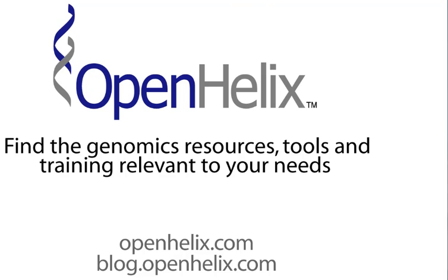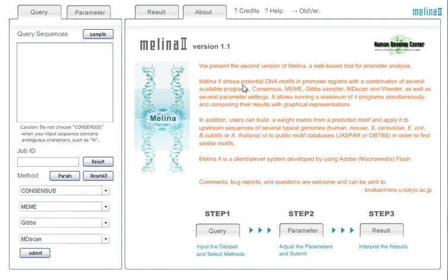But let's move right now over to the Melina II tool to get started. So I wanted to present Melina II today because at a workshop last week I was describing this tool to someone who had a need for promoter analysis. And this is a very nice web-based tool for promoter analysis.